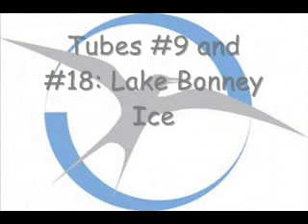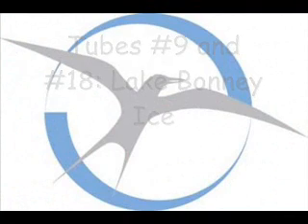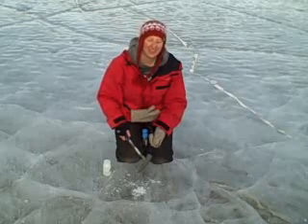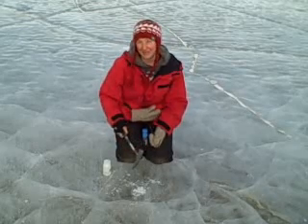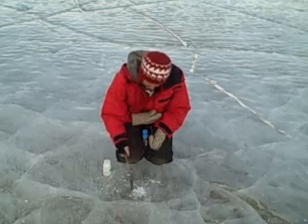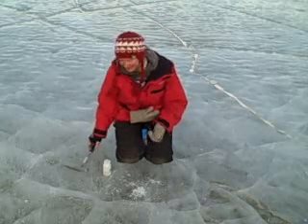For our next set of tubes, we're going to test the ice here on Lake Bonney. So I'm going to chip away a couple of pieces. Alright, looks like I got some good ones.